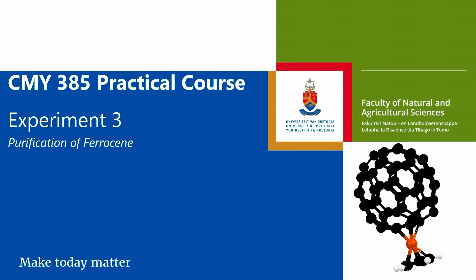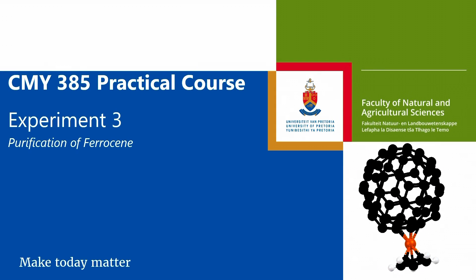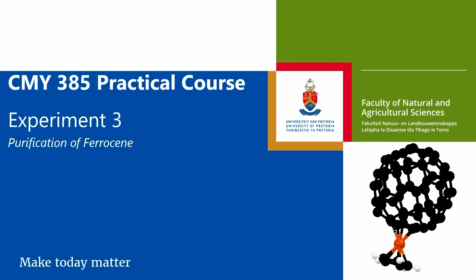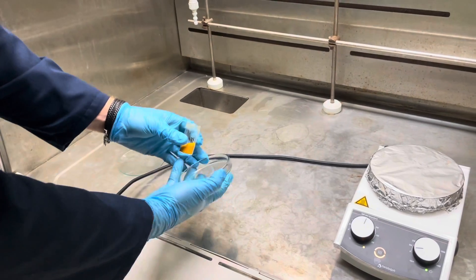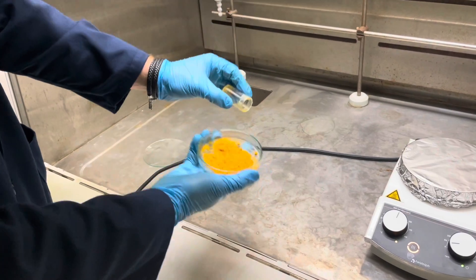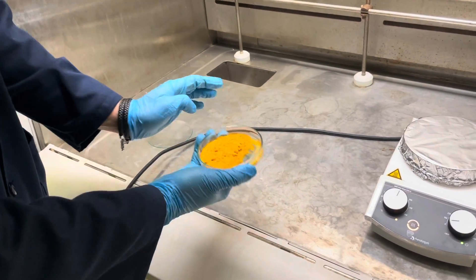Welcome to the experimental video for experiment three: the purification of ferrocene. Start by taking a petri dish and placing all your crude ferrocene in the bottom petri dish.